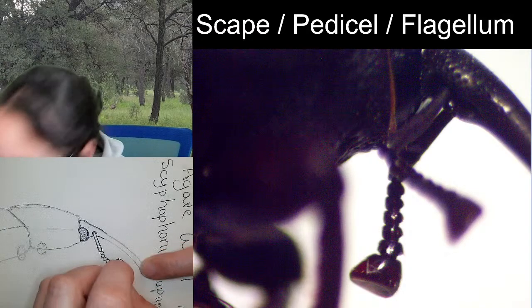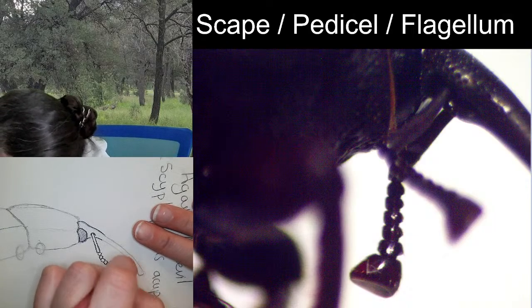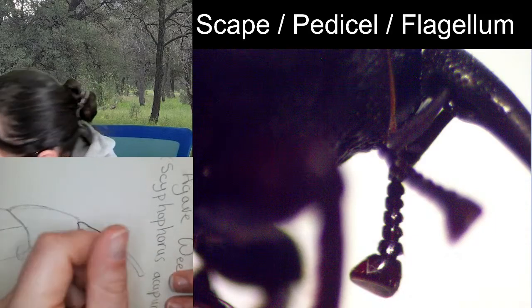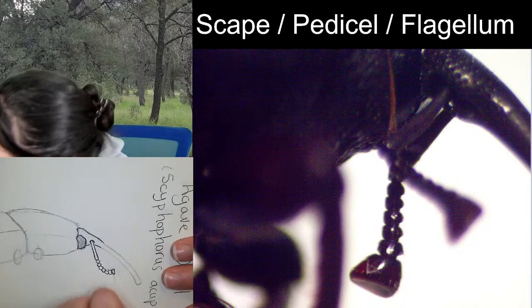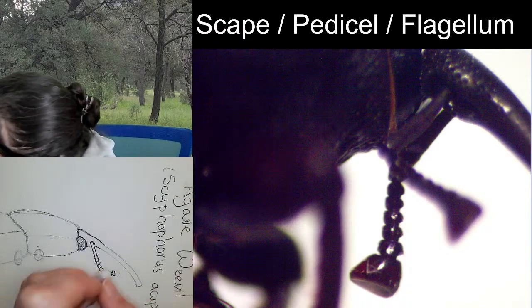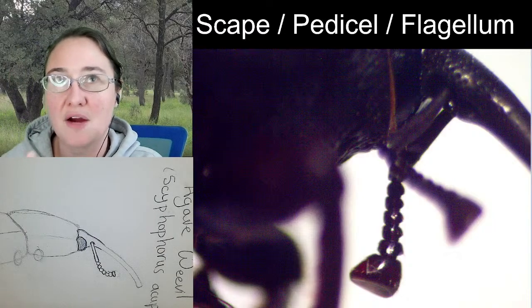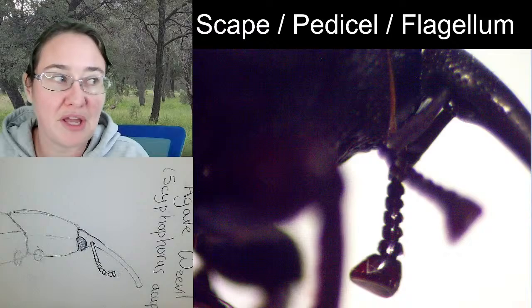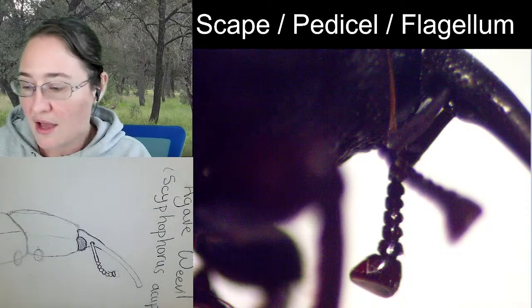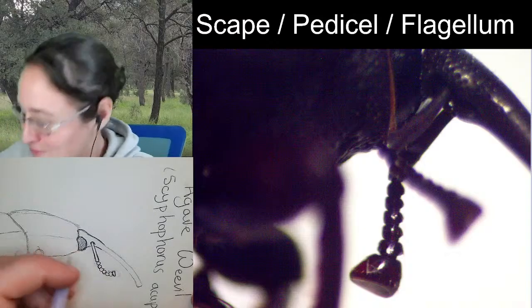But this is, I would almost consider it a club. I would consider this clavate, even though the thing that would almost stop me from calling it clavate is because normally clubs are more than one segment, so you'll see a 3-segmented club in fungus beetles. But this would be almost like a 1-segmented club, which I think is funny.